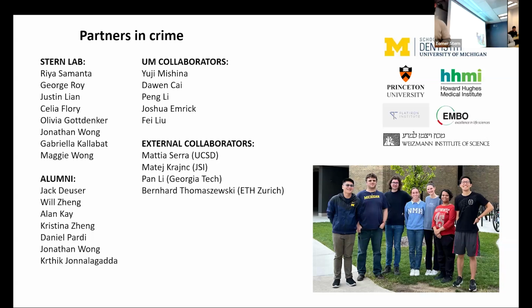I'm curious about the segmentation algorithm. You are using watershed, but I heard that when using segmentation algorithms, there is an issue. That's why there are a lot of other alternatives, something like deep algorithms. So do you have any issue when studying the embryo about the poor accuracy of the segmentation algorithm? I mean, it's not working well, something like that.